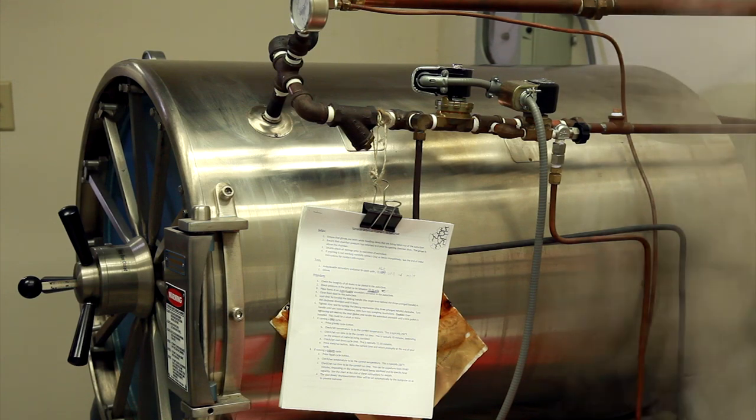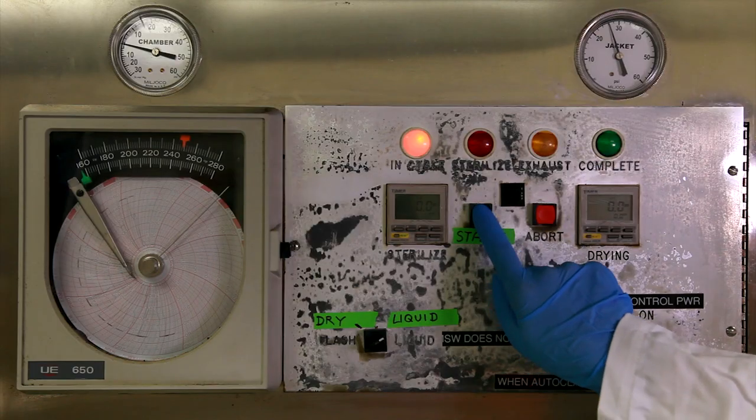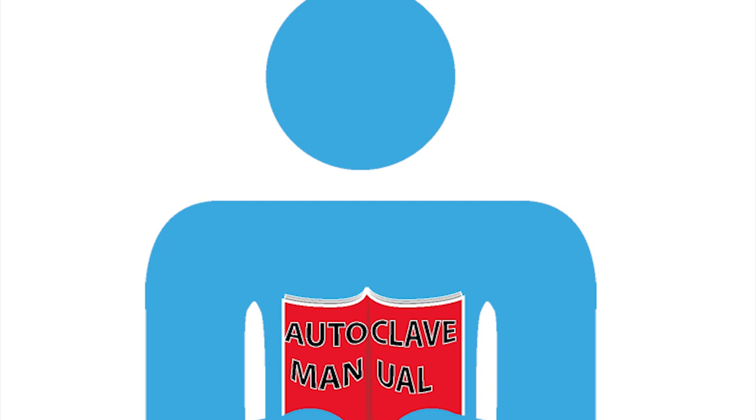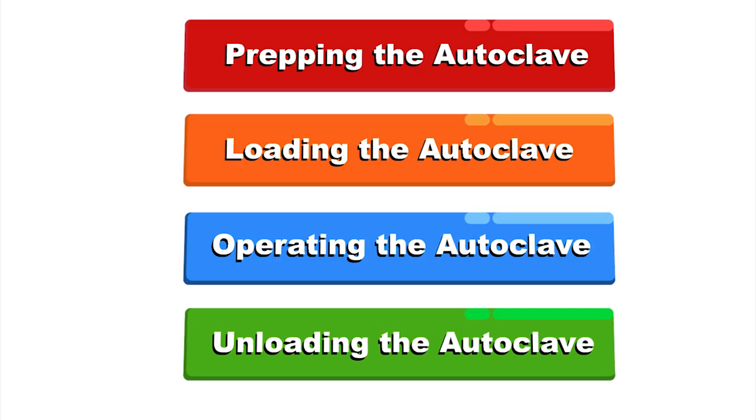While people still use stovetop pressure cookers to decrease cooking times for beans and sterilize mason jars or baby bottles, autoclaves in laboratories are used to decontaminate or sterilize various items using both steam and pressure. The reason we mention the high heat and high pressure is because these are also the hazards that must be considered when working near or operating an autoclave. There are a variety of autoclave styles found on the ASU campus, and while they may look slightly different from each other, they operate on the same principle and have several features in common. However, some autoclaves do have greater hazards than others. Always make sure you are properly trained on how to operate the unit you will be using.